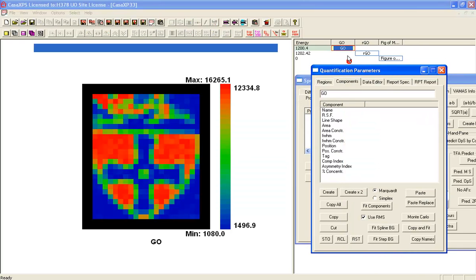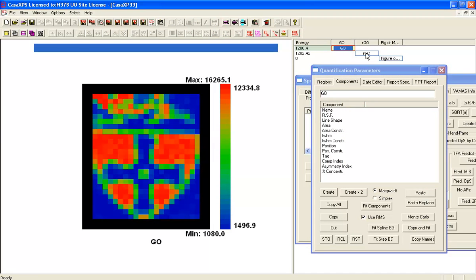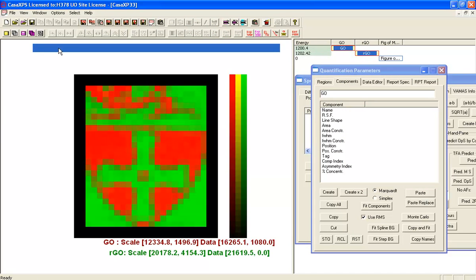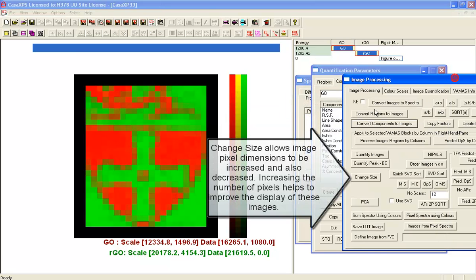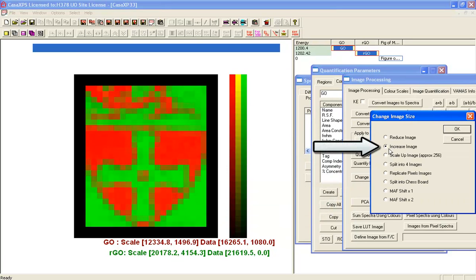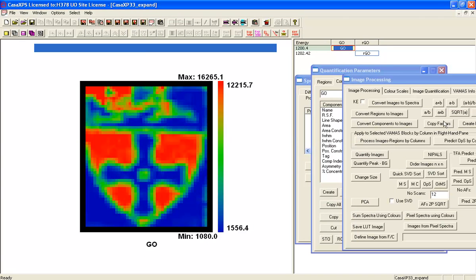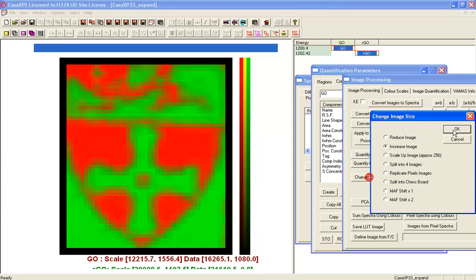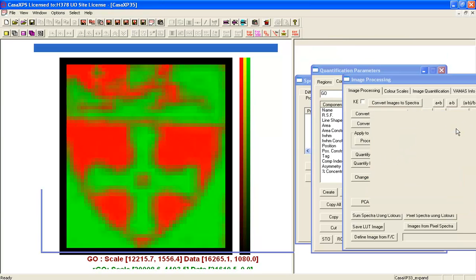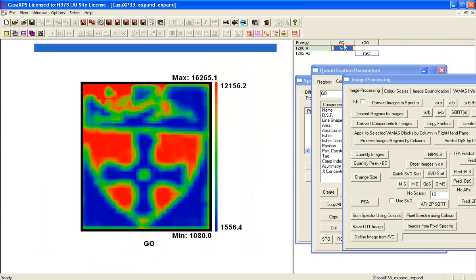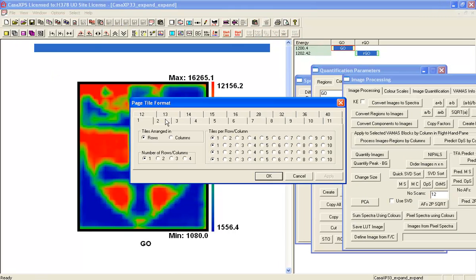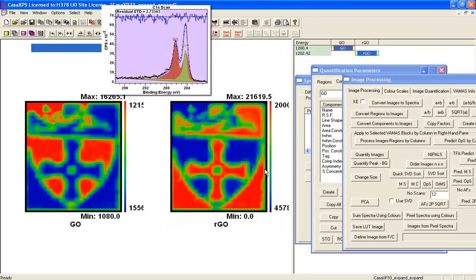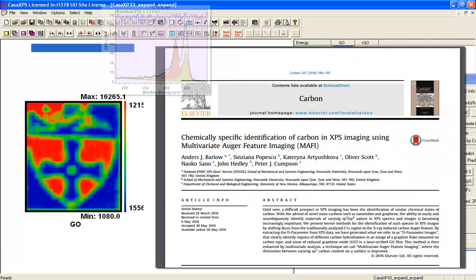This gives us a pair of images that are complementary, so they should be graphene oxide here and reduced graphene where it's green. We could just try and make this look a little bit more interesting by increasing the size of the images—we can get the pixelation to reduce. So we have a pair of images, and these represent graphene oxide and reduced graphene oxide.